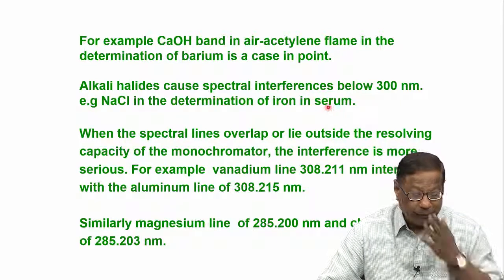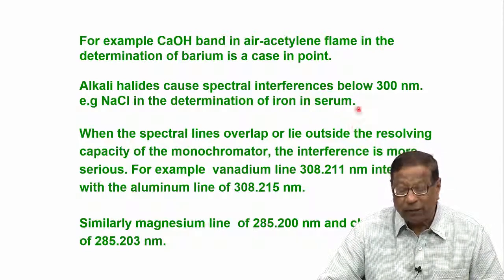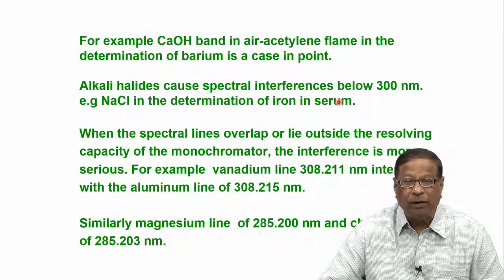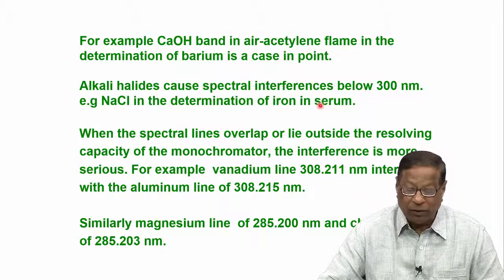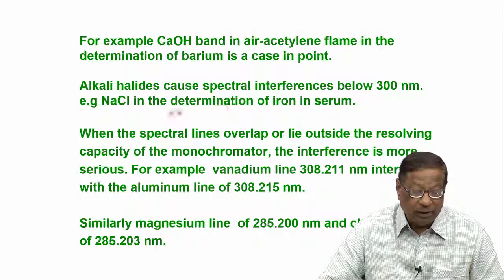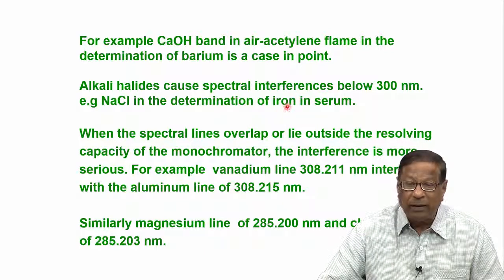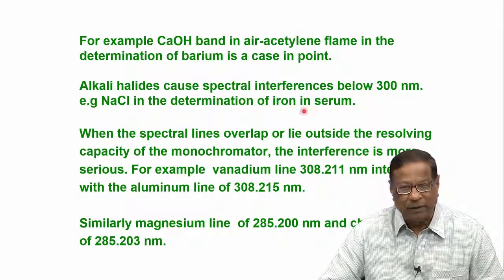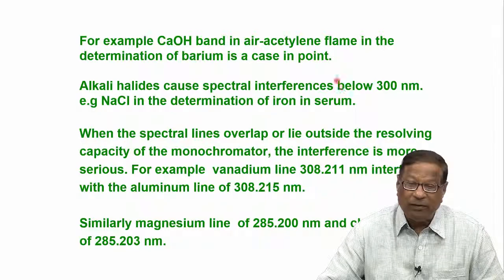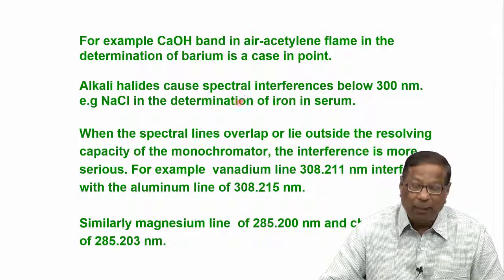Okay. So, people want to know how much sodium is there in the case of blood pressure. Somebody is having blood pressure, they find out how much sodium is there in the serum. Sometimes the doctor will order: determine iron, hemoglobin. What is the hemoglobin in the serum? But serum itself will contain a lot of sodium chloride. So, this kind of error happens here.